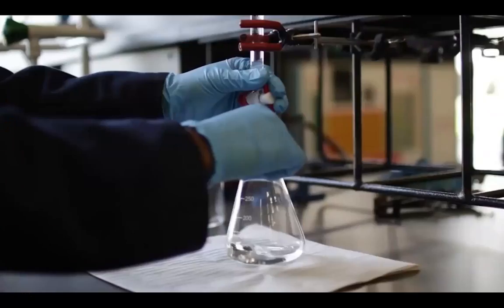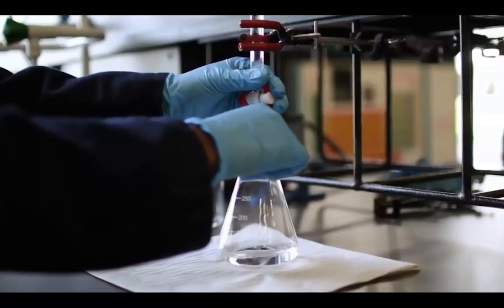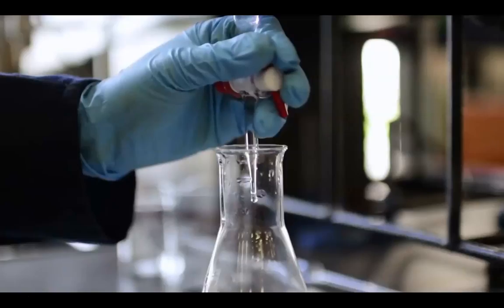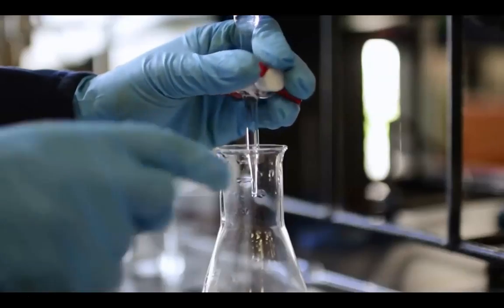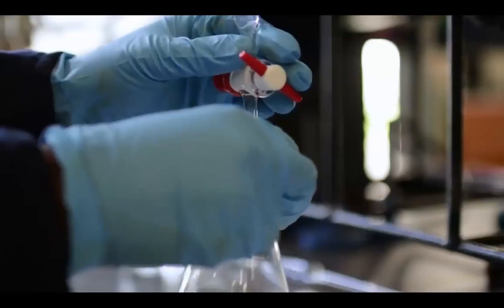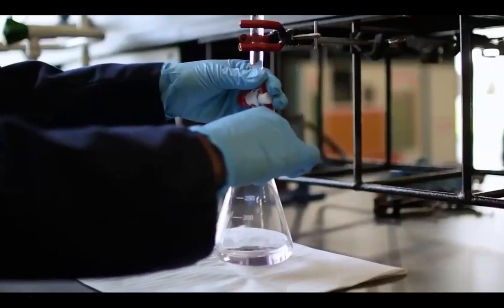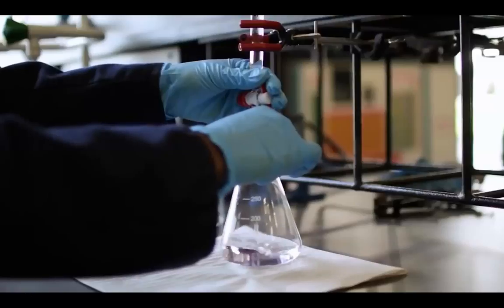Here is an example of the titration near the endpoint. Initially, you allow the titrant in quickly because you've already done a rough titration that tells you how far to go quickly before slowing down. But when you get near the end, you can actually allow just one drop at a time. Swirl in between until you get the faintest pink color, and at that point you have reached the end point and the end of the titration.